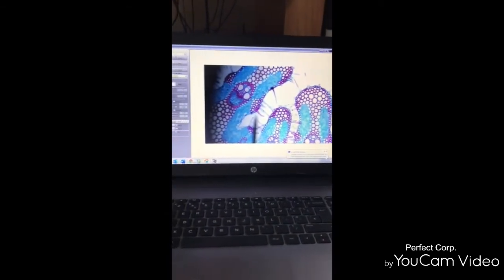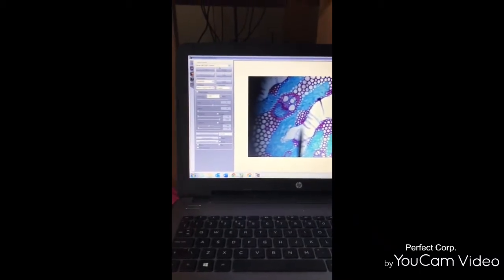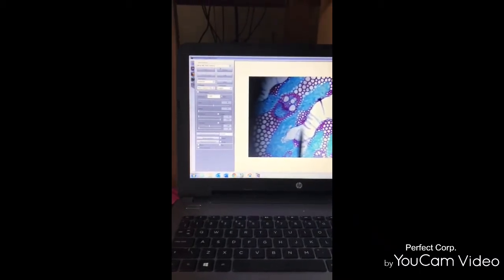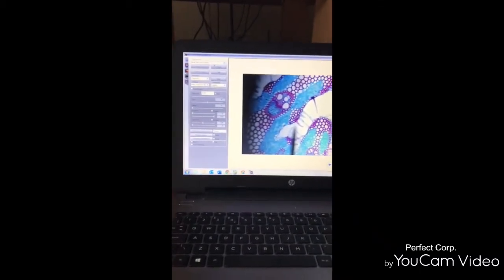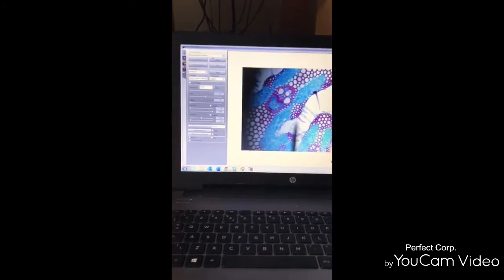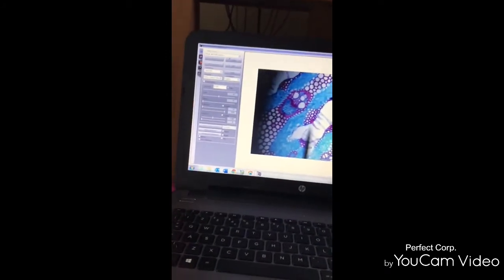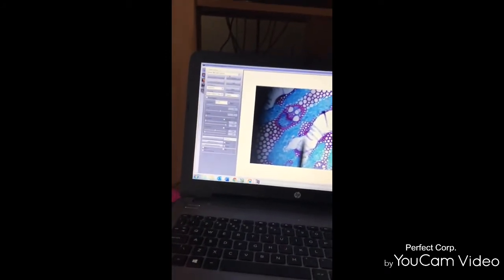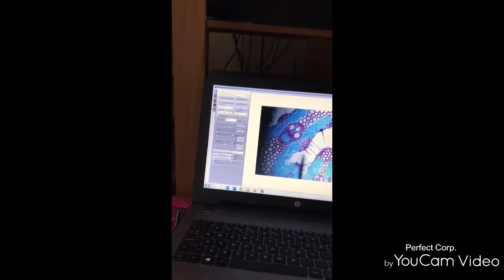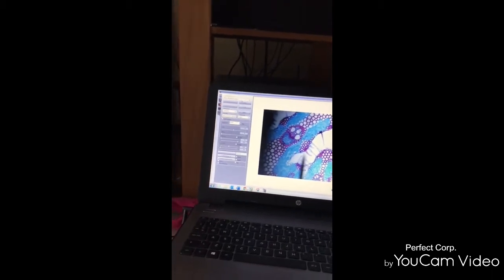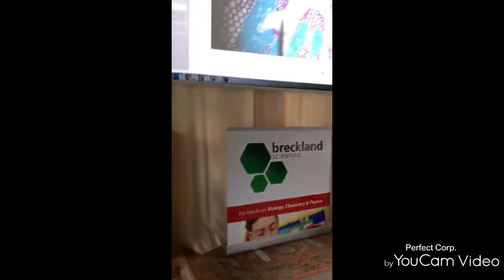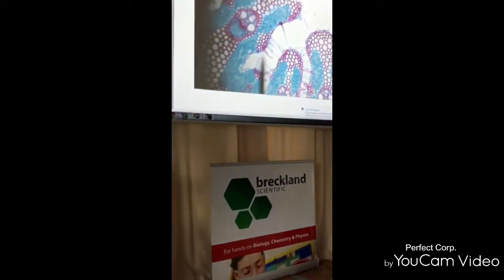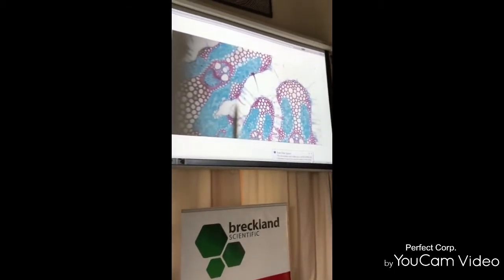You will of course have downloaded Motic Images 3, which comes with the camera. Then you connect with an HDMI cable to however you get it up to your projector.